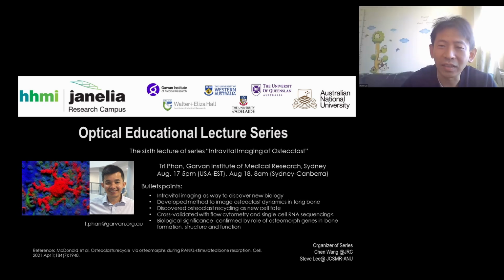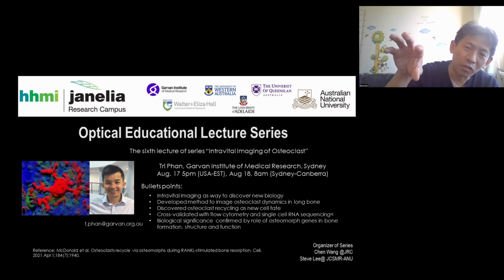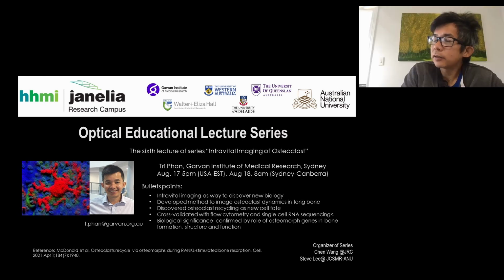I see. And I guess the next question, going back to the microenvironment, is that there will be some fluid shear, though it might be quite low. In some of the videos you showed, when the osteoclast was reaching out, would that be because it's sensing some fluidic imbalance within the microenvironment?